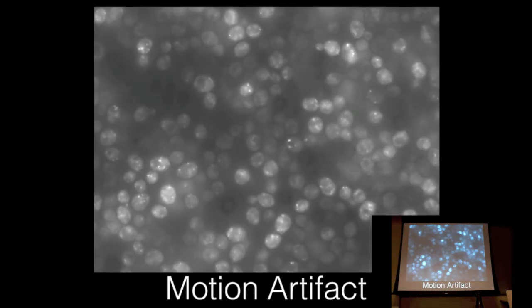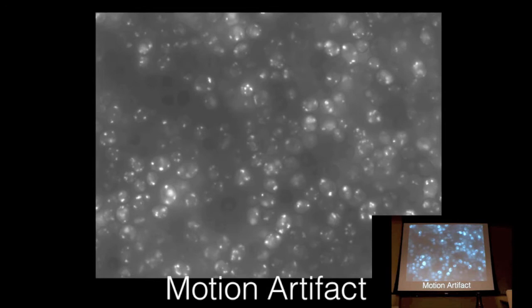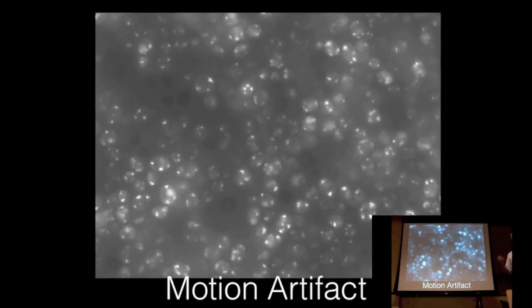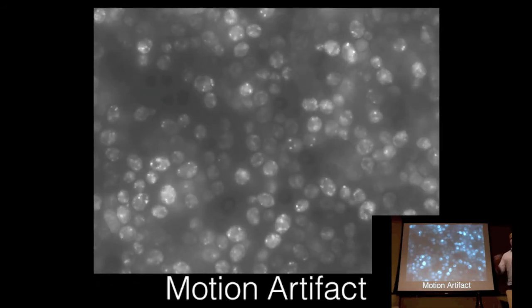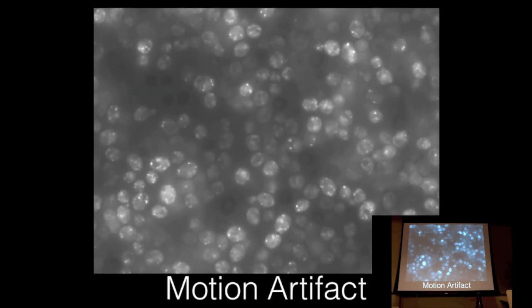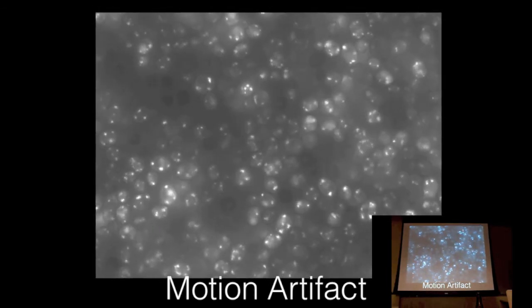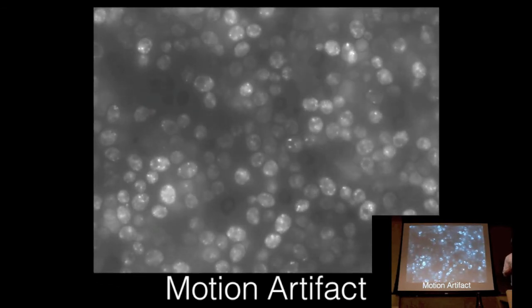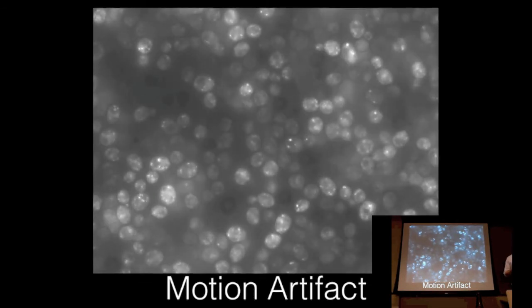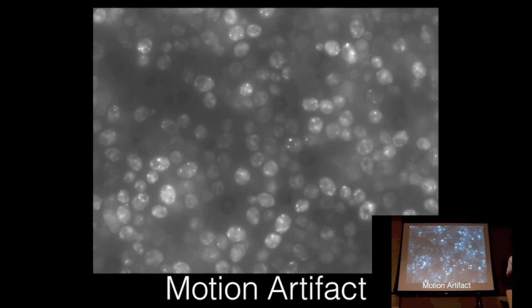Back to my original point about closing the loop between the analysis and the experiment: it might not seem like a big deal, but maybe it is, and you didn't really think about it unless you started doing that analysis much sooner. A lot of that is actually something we can't avoid, because if we were to warm it up, then these puncta would form and we would miss their initial formation. So a lot of this is figuring out what you can accept as errors in your data. Actually, in the first few frames there shouldn't have been any puncta for you to focus in on.